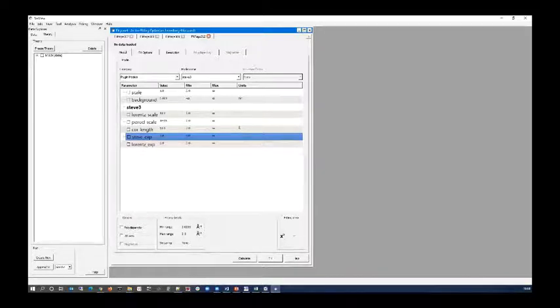So I think Otto touched on this in his talk. A correlation function describes how the probability of observing some physical quantity varies in time or space relative to some reference. A temporal example many of you are going to be familiar with is the intensity correlation function from dynamic light scattering, which is quantifying how the coherence of the scattered light is changing with time as the particles are undergoing Brownian diffusion. A spatial example that Otto showed was a pair correlation function or a radial distribution function when he was talking about structure factors and coordination shells.